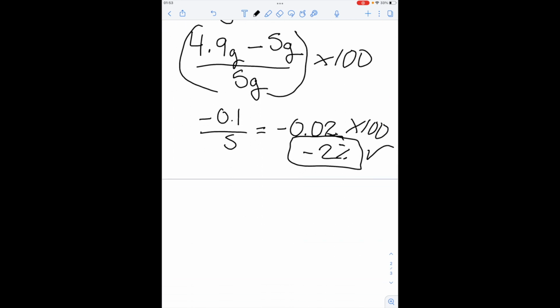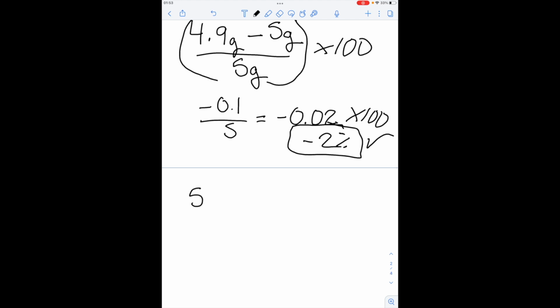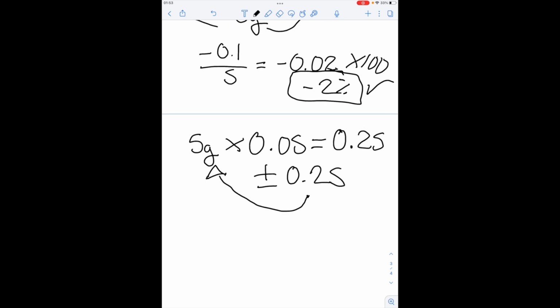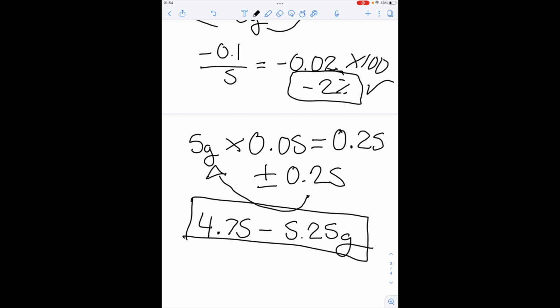And if you keep having to go back to remeasure things, you're good. Okay, so here our expected amount was 5 grams times 5%, 0.05. And if we do that, we get 0.25. So remember, then we're going to have to plus and minus 0.25 from our original 5 grams. If we do that, we end up with a range of 4.75 to 5.25 grams. So anything within this range would check out.